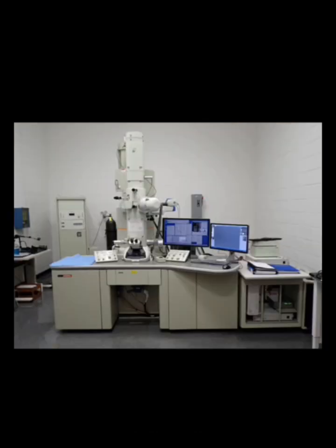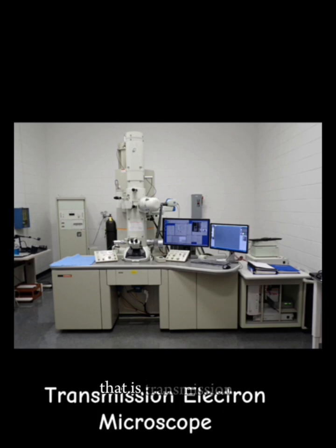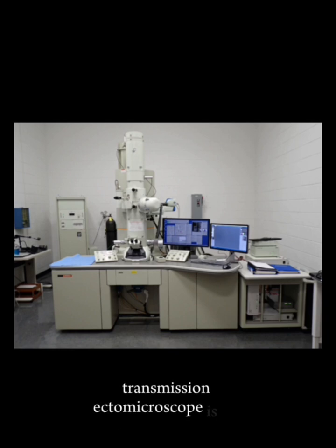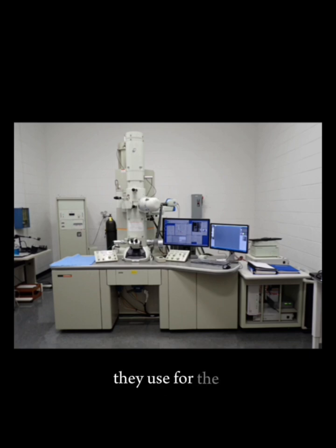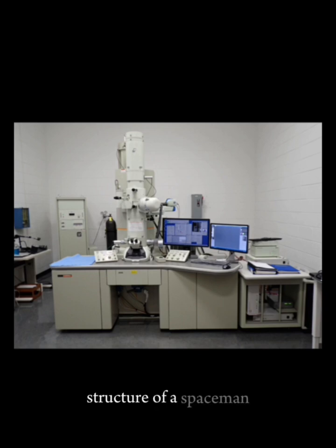And now let's move on to the second type of electron microscope, that is transmission electron microscope. Transmission electron microscope is another type of electron microscope that transmits a beam of electrons through the sample to create an image. The specimen used for the transmission electron microscope should be 20 to 100 nanometers thick. Moreover, this kind of electron microscope is usually used to study the internal structure of a specimen.